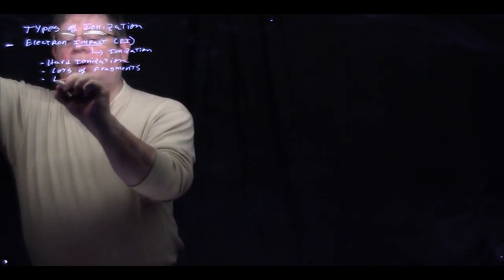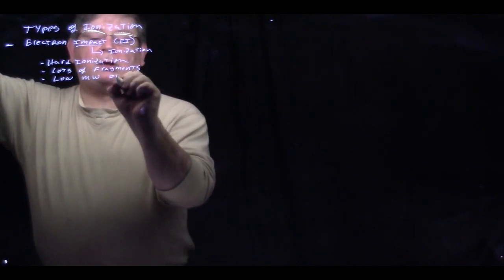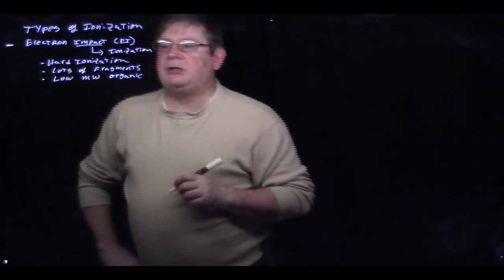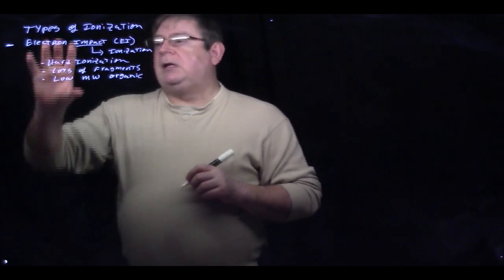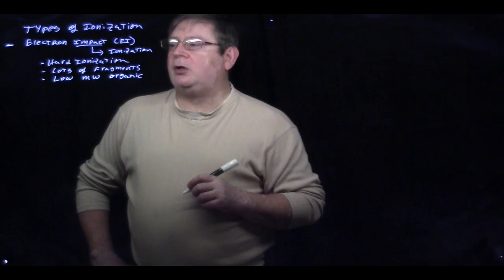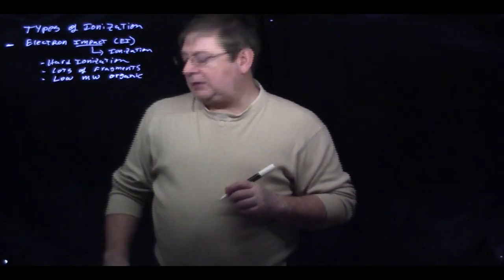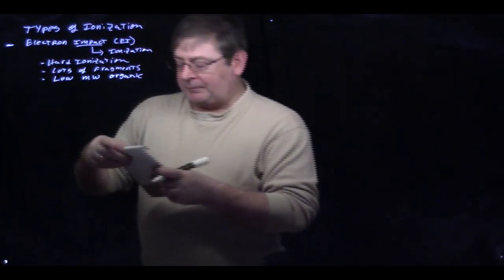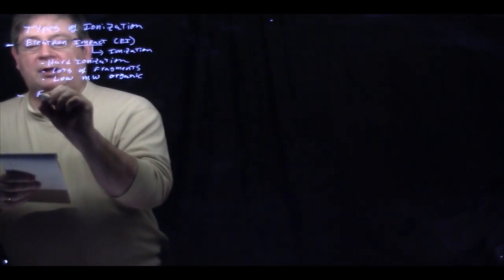And this works very well for low molecular weight organic molecules. And this is typically what you have in what's known as GCMS, or gas chromatography mass spectrometry. And so we do have some GCMSs on campus, and they all use electron impact type ionization sources. But again, you're going to be really limited to those low molecular weight organic molecules with these. Okay. In our labs here, we actually have access to what is known as electrospray.